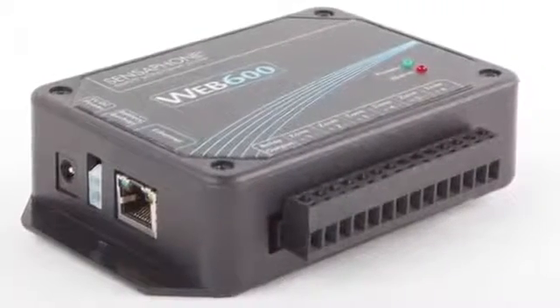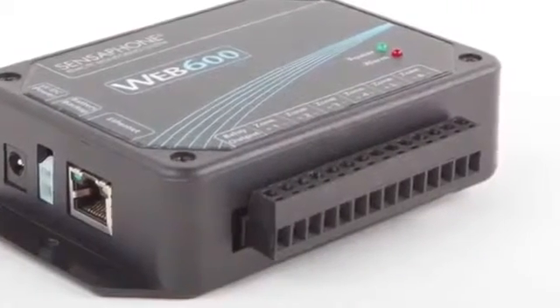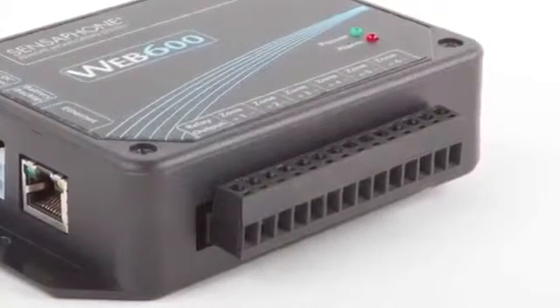Users can connect up to six external sensors to monitor a variety of equipment and conditions. Each input zone can be connected to a temperature sensor, an analog transducer, or a dry contact switch.